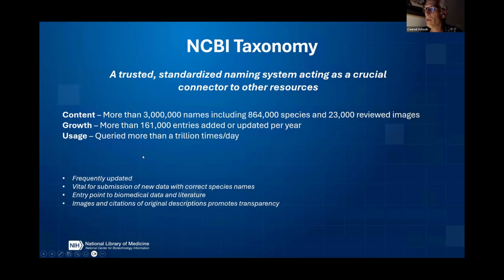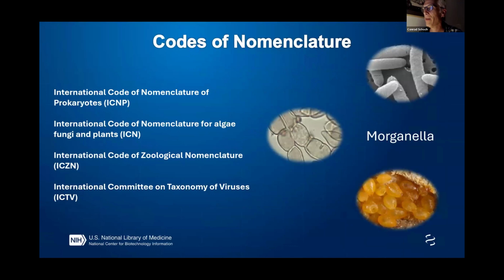Most of the resources at NCBI and beyond use the names that we provide, and they need to verify when a name's been updated, like the BLAST system. The BLAST system will now propagate that name through its databases. Like I said, it doesn't happen instantaneously, but it will happen maybe within a week, I hope, that you'll be able to see that in BLAST.